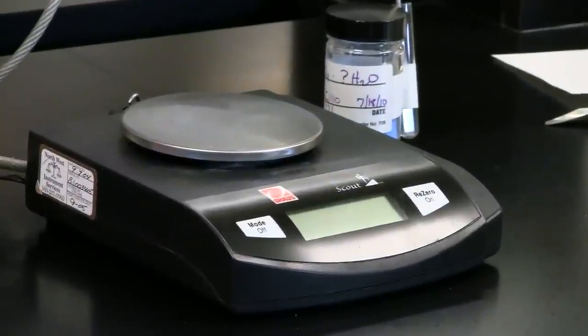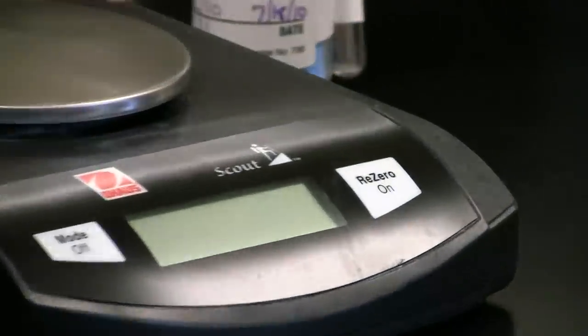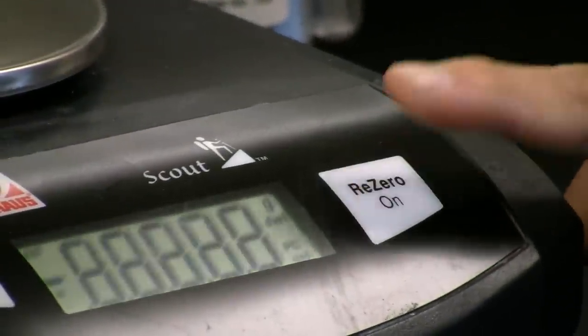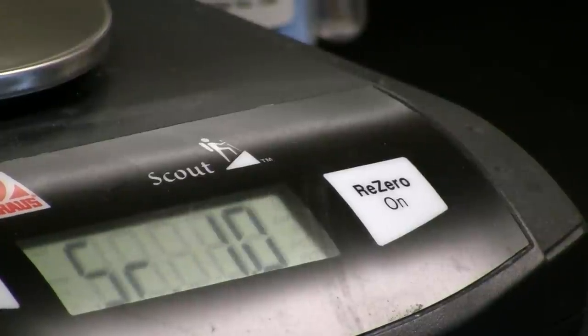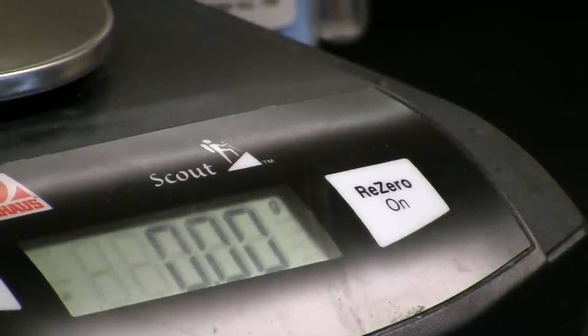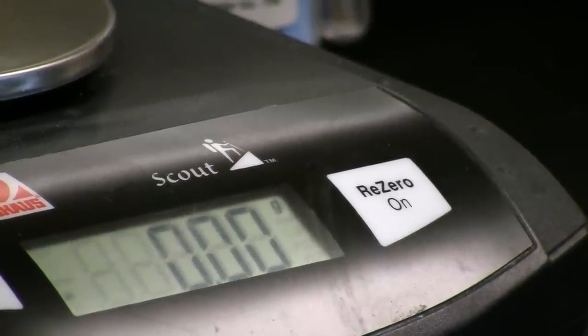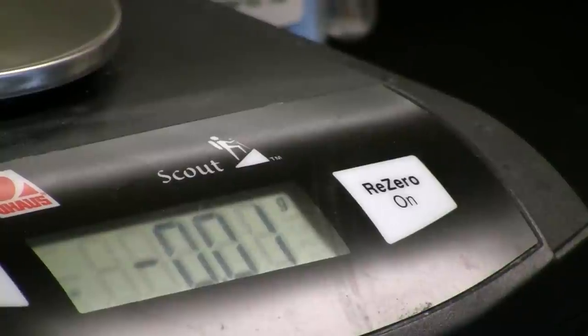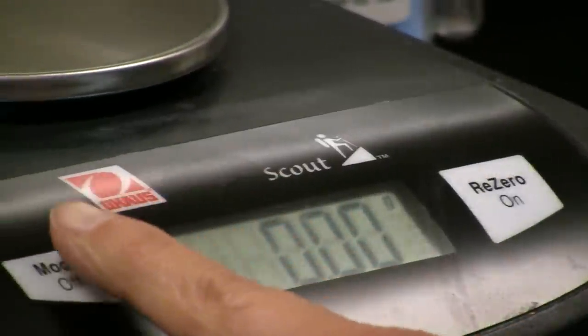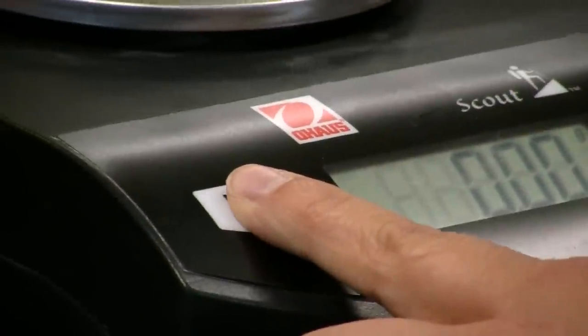Next, ensure that the balance is on and that the correct mode has been chosen. The upper right-hand corner of the display should show G for grams. Use the mode button to cycle through other units back to grams if necessary.